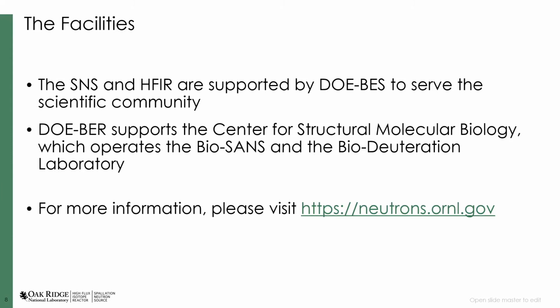There is one exception to the DOE BES support, which is the DOE Office of Biological and Environmental Research supports the Center for Structural Molecular Biology. They're responsible for operating the Biosans and the Biodeuteration Laboratory. So Biosans is at HFIR, and I'll talk about that in a bit. The Biodeuteration Laboratory is up here at SNS. These are facilities that DOE BER supports as user facilities.